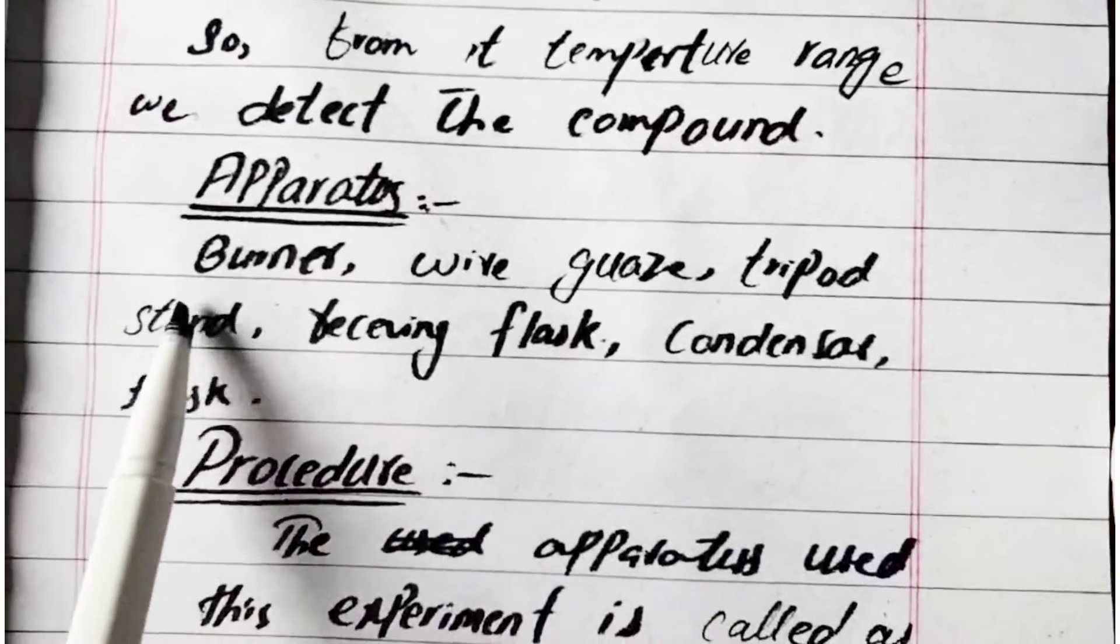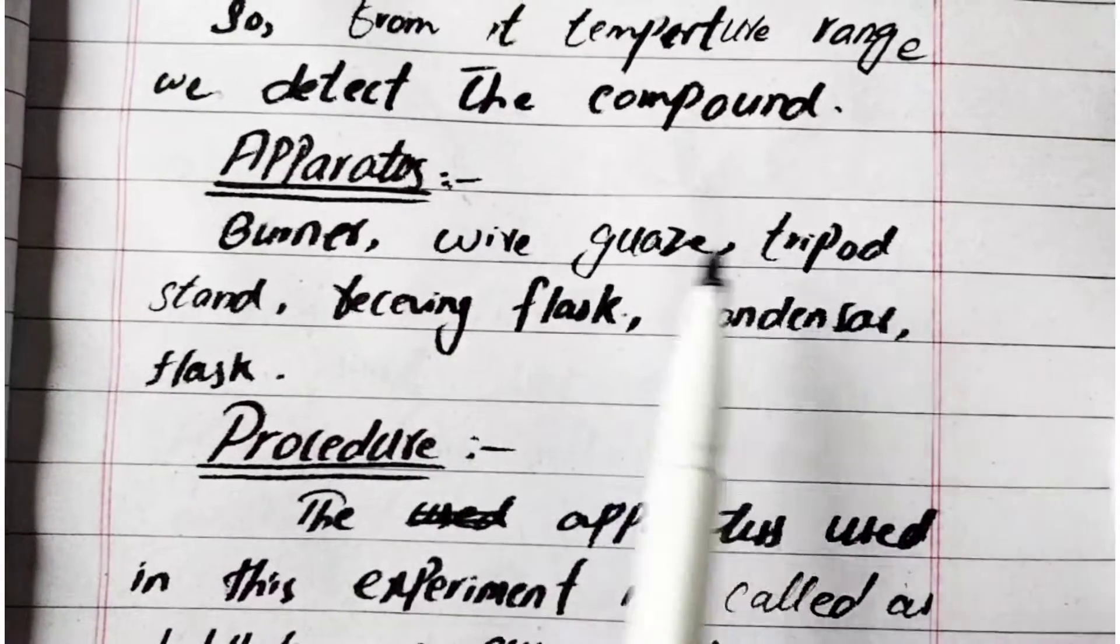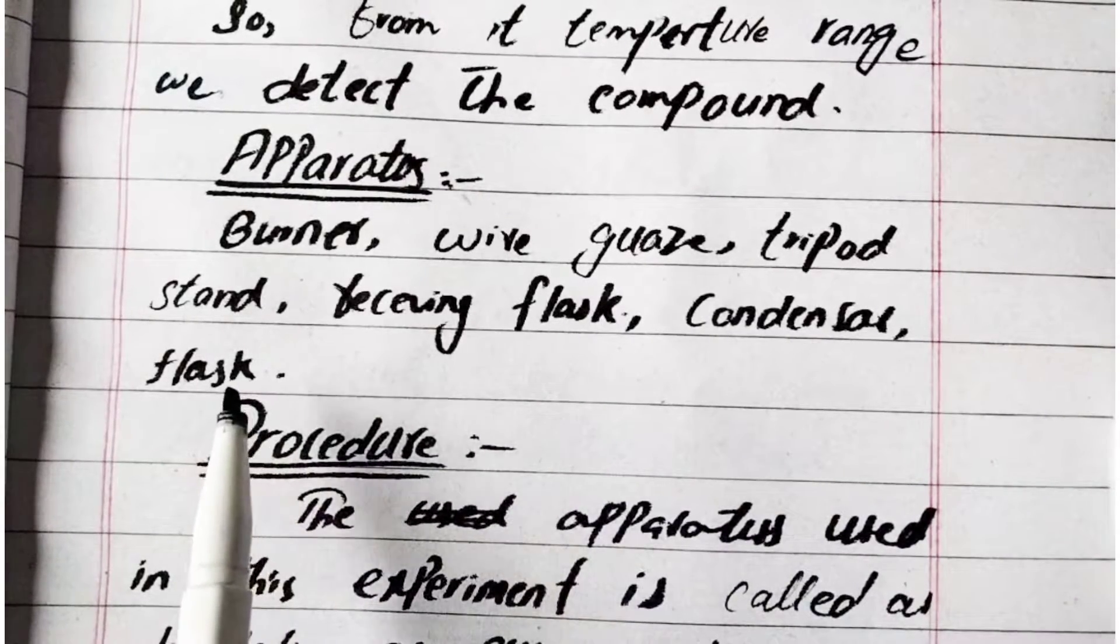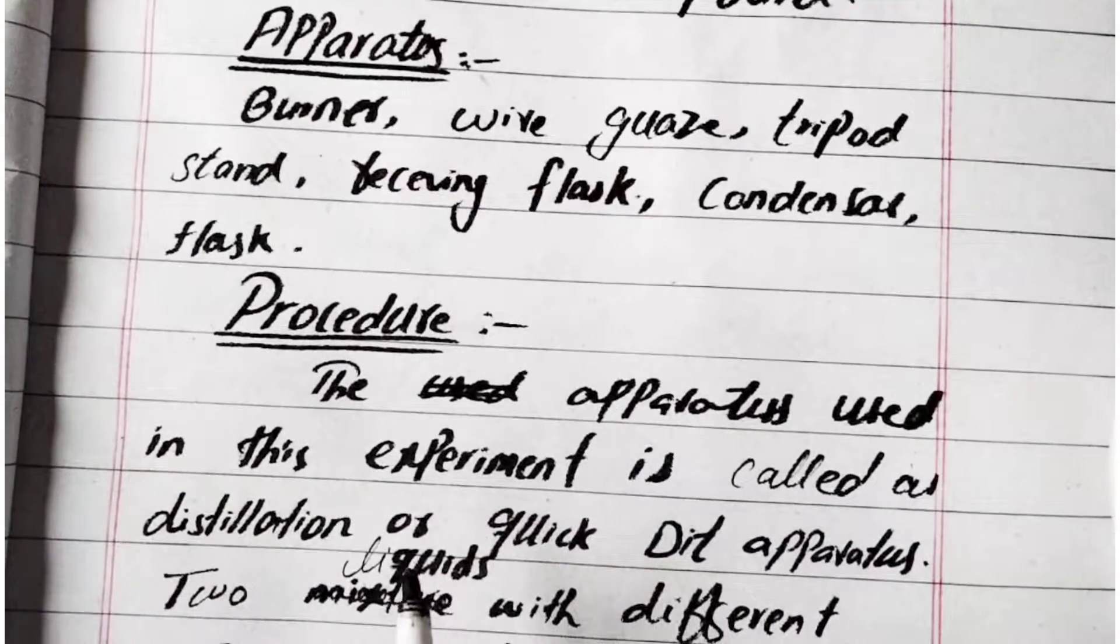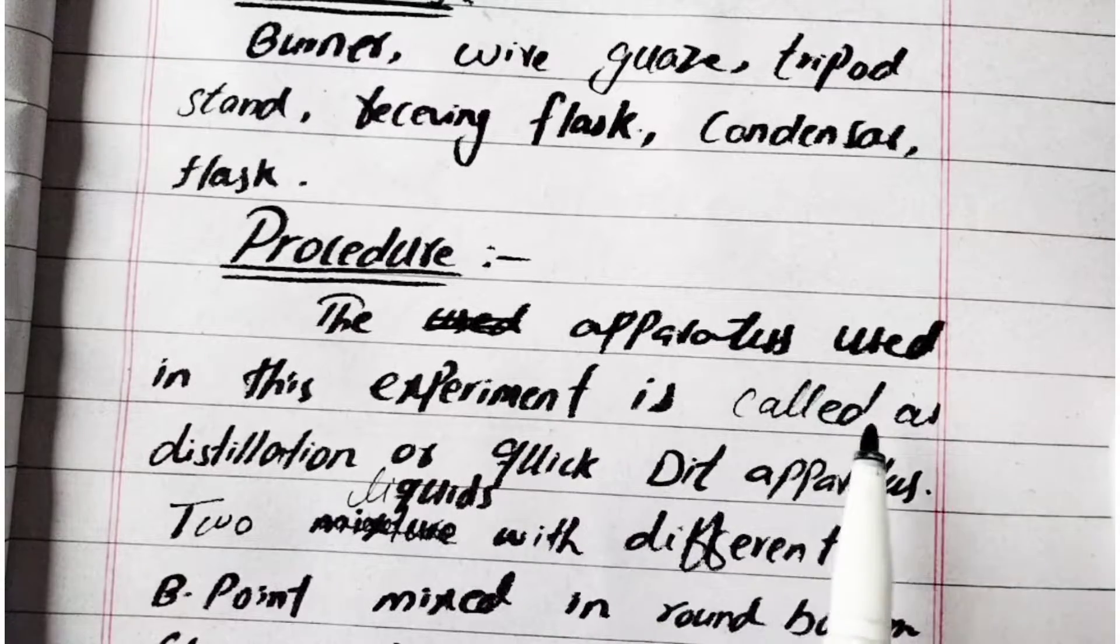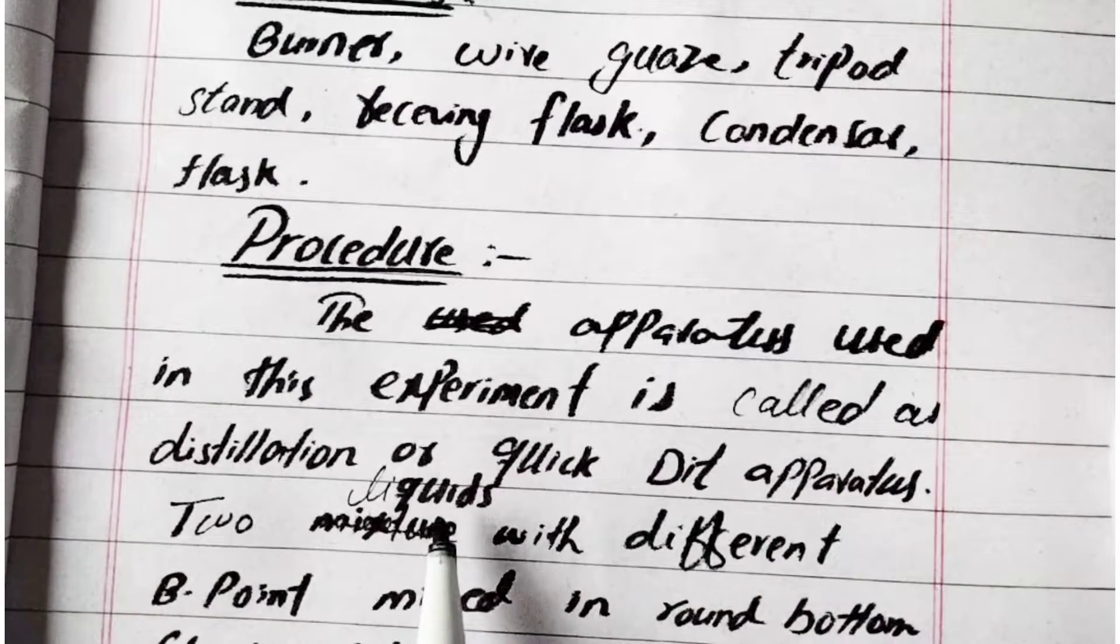Apparatus used in this case is burner, wire gauze, tripod stand, receiving flask, condenser, and flask. What is the procedure to conduct this experiment? The apparatus used in this experiment is called distillation or quick distillation apparatus.